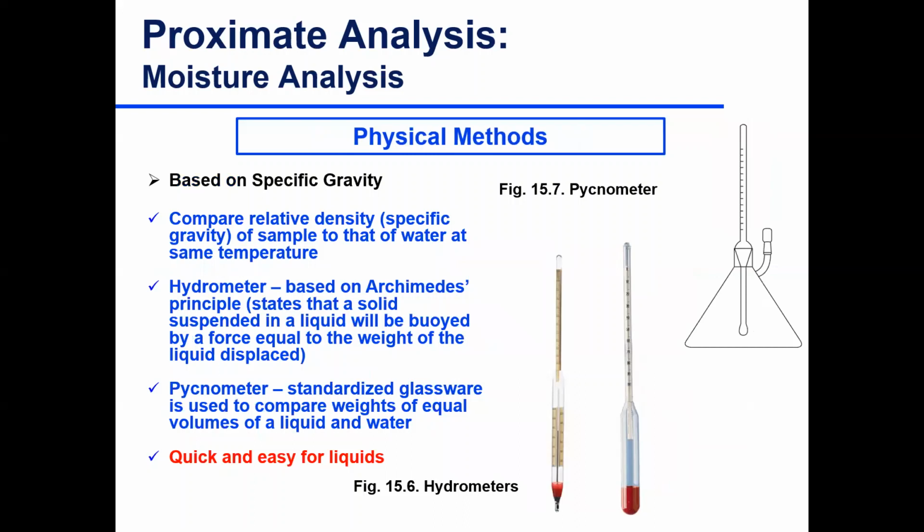How many of you have ever used a hydrometer? I'll be darned. Okay. What were you using it for? Measuring change in sugars in beer, alcohol. Okay, sure. Good applications. I've also used it for sugars in sorbets, before you put it in the freezer, you want to make sure you have the right sugar ratio. It's a very simple methodology as well.